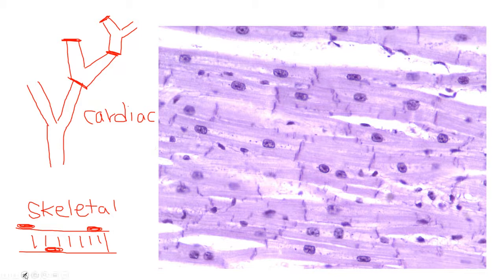So the big thing to check for with cardiac muscle tissue is those intercalated discs. That's the thing that makes the most sense to look for. Also, potentially some of that adipose in between those cells.